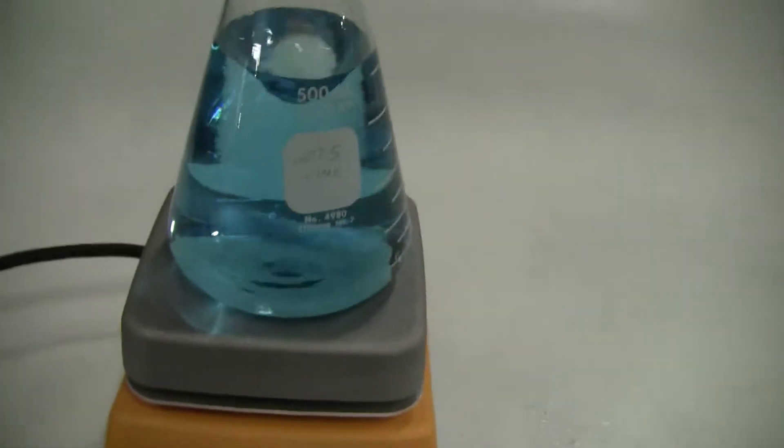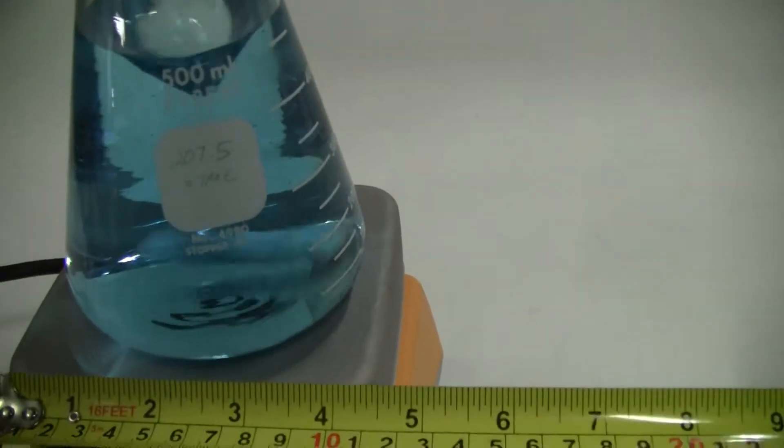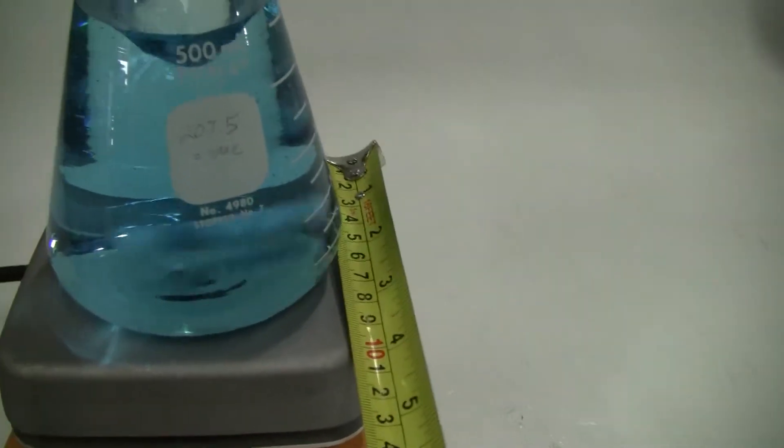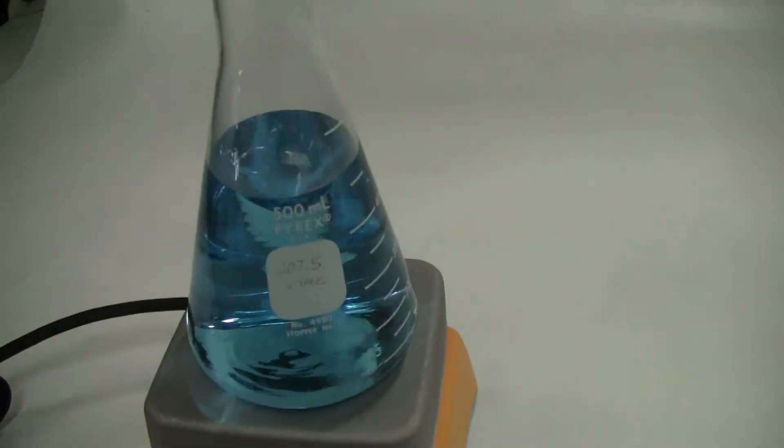Dimensionally, just about a 5x5. It's a usable space 4x4. It's a 500ml beaker on it.